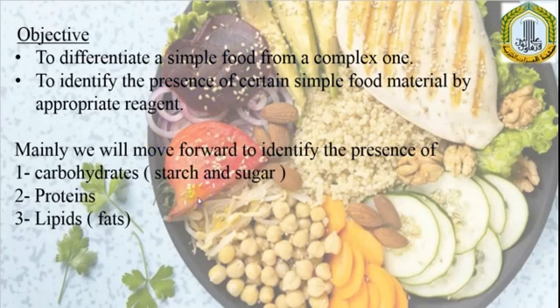Today, mainly, we will be introduced to the first two tests only, which identify the presence of carbohydrates, mainly sugar and starch, in the food we eat.